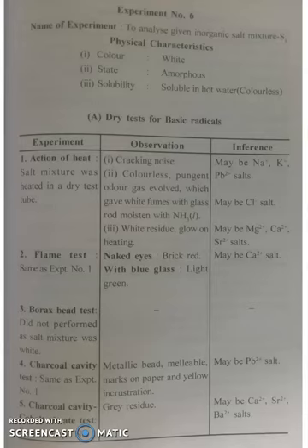So you can see here in physical characteristic, if your compound looks white, in place of color, write down white. Then check the state. Is it amorphous or crystalline? If amorphous, you write it amorphous like this. Then solubility. Soluble in hot water. So write down soluble in hot water in place of solubility.